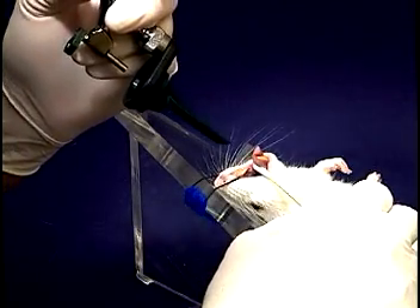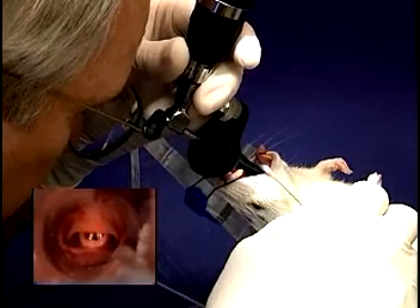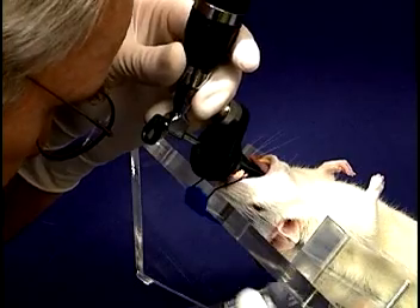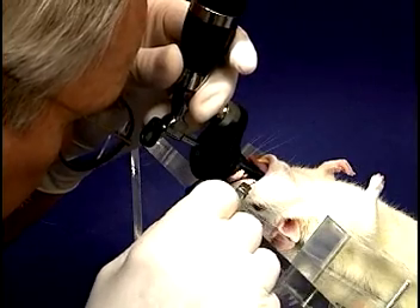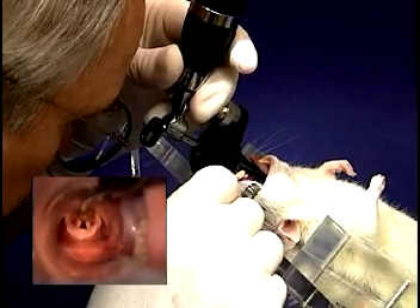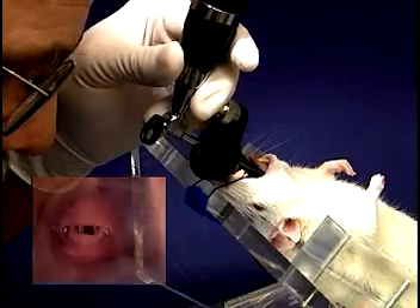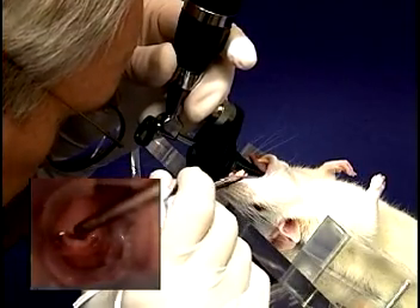Make sure that the otoscope light is on and, with your hand braced against the stand, insert the blade slowly into the mouth, parallel with the hard palate or the stand, until you can clearly see the cords. At this point, the swab can be removed and the lidocaine applicator inserted at the side of the mouth and advanced towards the cords as shown. If the cords are not clearly seen, slight pressure applied to the soft palate with the lidocaine applicator will often bring them into view. One or two drops of lidocaine are applied and a few seconds are allowed for it to take effect.